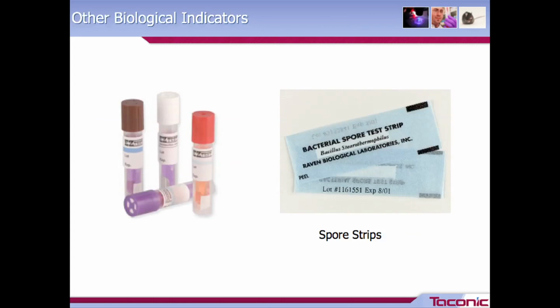This is just another brand that I found online, and the different colors, the purple, the red, the brown, are for different types of sterilization. They'll have different spore strips in them. The other product that you'll see a lot of, it's a lot less expensive, but I will tell you it's a pain in the butt, are spore strips. And they come in these little paper wrappers, and same deal, you stick it in your load, autoclave it. The problem that we have with these is the little paper gets wet, and then when you're transporting it to the lab, and then the lab has to get it open inside a biosafety cabinet, you can get contamination. And we have seen it quite a bit. So I would not recommend using these, even though they're like 1/10 the cost. They're gonna cost you a lot of time and effort in the long run with false positives.